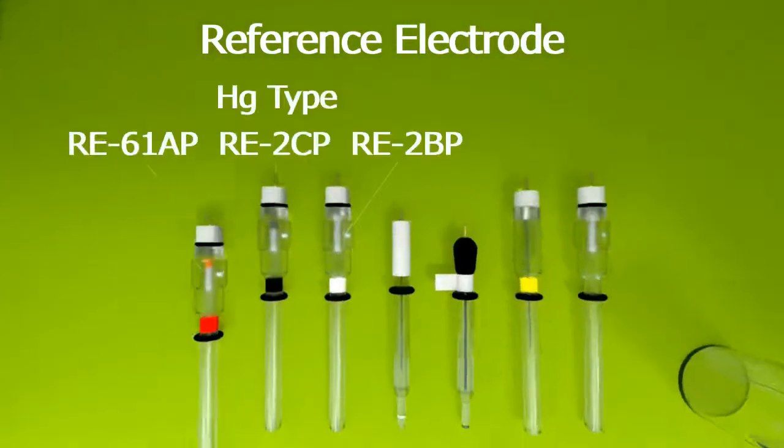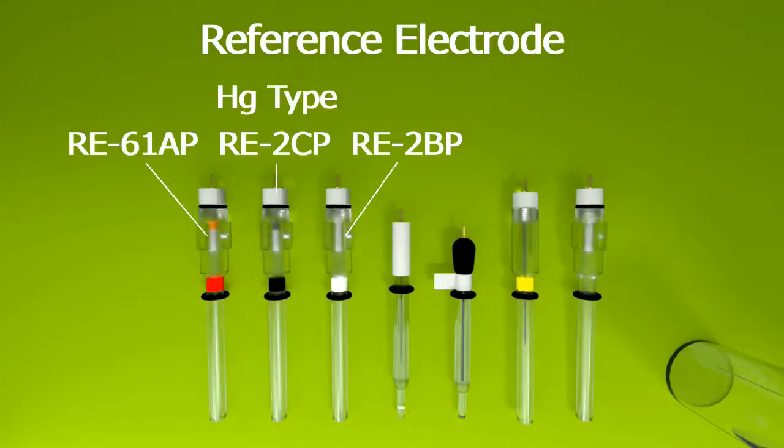Mercury types are also available, which include reference electrodes for alkaline solution.